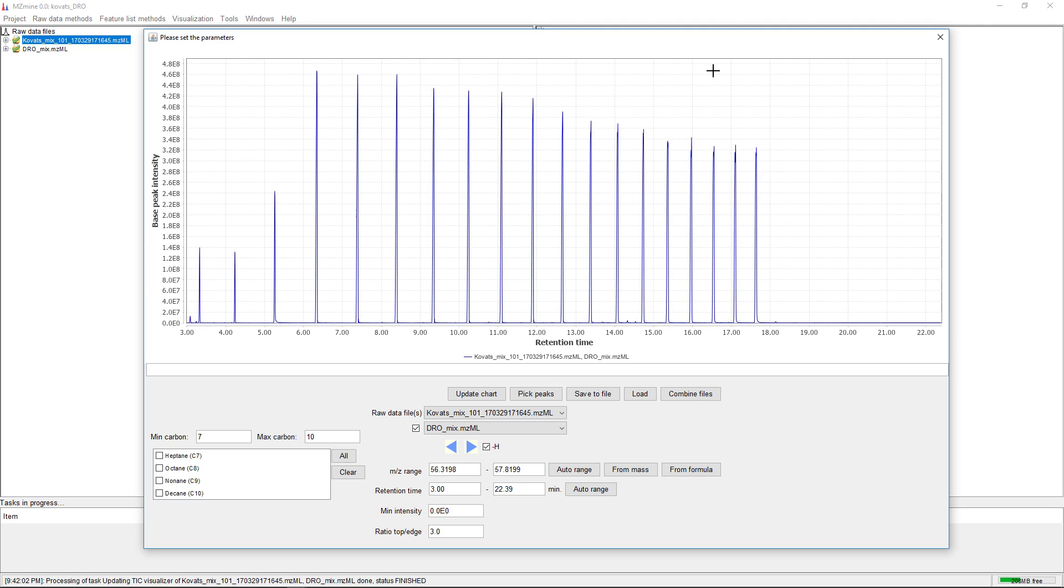You can download spectral library for GC-MS from MassBank of North America, or you can use the GNPS GC-MS workflow.